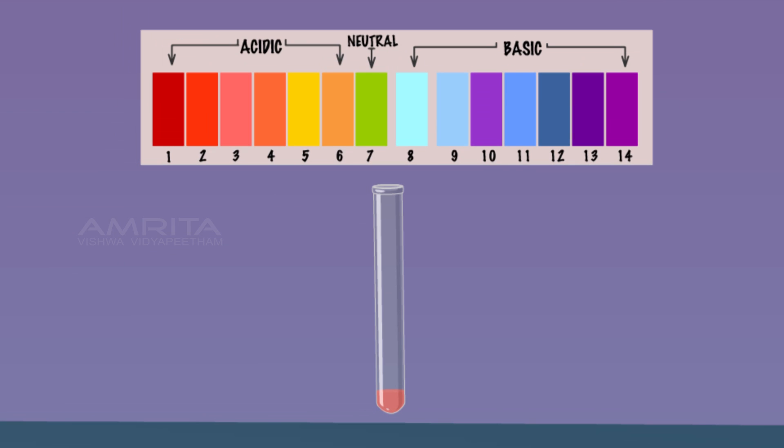Compare the color produced in the test tube with the standard color pH chart and note down the pH from the color chart. The pH of acetic acid is 3.